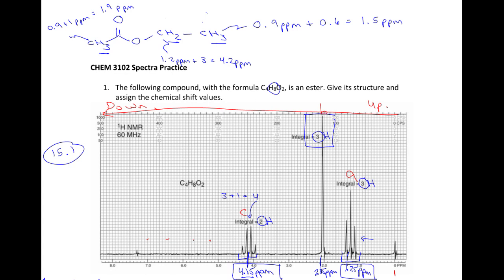Then when we go back to the compound whose structure we've elucidated, we label the protons of the triplet with the letter A, so we put the letter A next to that methyl group. Then the quartet protons we label C. And finally, the singlet gets the annotation B. This is the proper way to annotate the spectrum. If everybody labels the spectrum going from upfield to downfield, A, B, C, D, and so on, then all molecules should be labeled in the same way if they're done correctly.